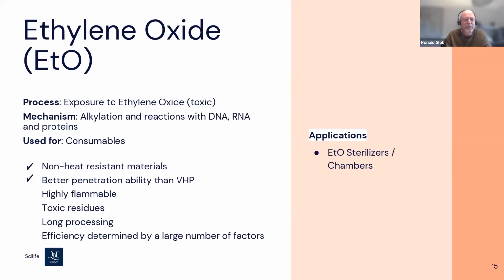It's commonly used because it's one of the gases that has the advantage that it can penetrate a little bit inside your product itself. It has a very good kill rate of microbiology, really getting you to a sterilized environment.